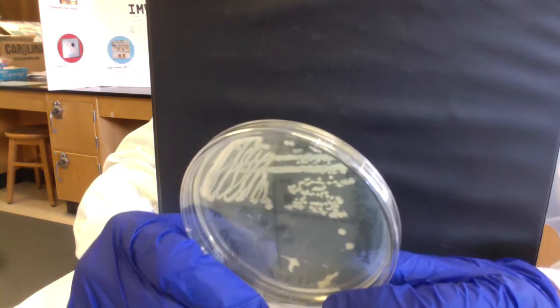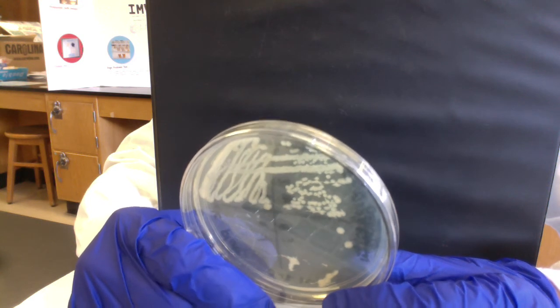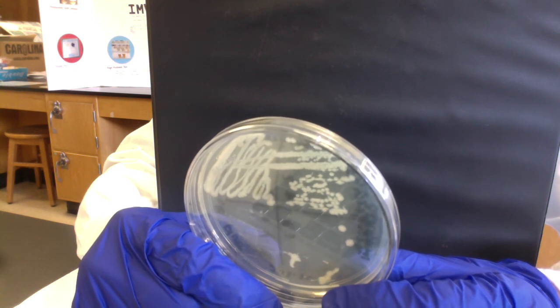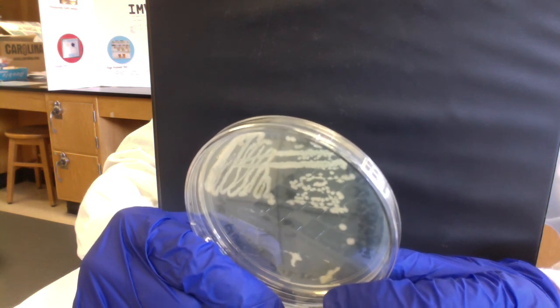I could transfer some of these cells to a new plate, incubate it, and then I have a whole plate of pure culture. Then I could use that to run my metabolic tests and antibiotic sensitivity tests.